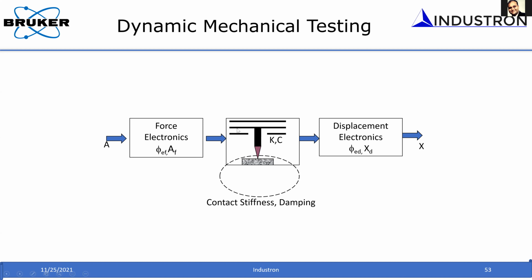These experiments are done in air. So when the air is there in between these two plates, it kind of damps this transducer. So you have a kind of a damping coefficient associated with the transducer. So you need to know what the damping coefficient is. You need to know what the spring stiffness is. I mentioned that the center plate is suspended by a spring. So the spring also has a unique stiffness.